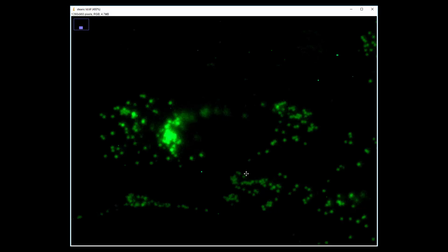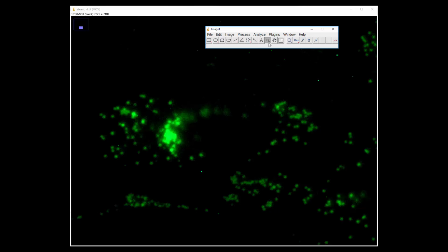And so if you don't remember where one cell begins and the next cell ends and so forth, go back to the original merged image, right? And go from there. Now, for this particular purpose, there's a couple of different ways one can do this. I'm going to show you the simple way. If you want to go into more detail, I would suggest going on Google and typing in a variety of ways to do this as well. Google image search with ImageJ is just really intuitive. It works really well. But for our purposes, the simplest way to do this is to use this multi-point selection tool and make sure that it has numbers on it.